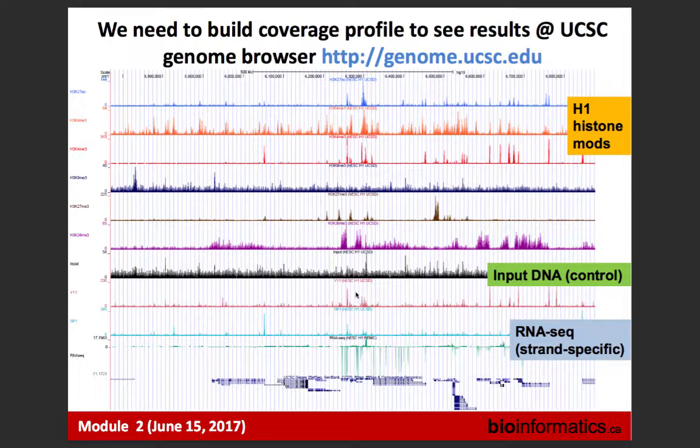So that's very visual, right? That's what we were discussing, that we would like to drop those duplicate reads and see where they collapse in the same location, where they're stacked on top of each other. They're not going to stack exactly, but fortunately for places where they should, they will create these little towers that we can look at. Now, there is a notion, people call them peaks. Of course, generally speaking, when we talk about histone modifications, some of them are extended regions, not just peaks. So I prefer to call them enriched regions.